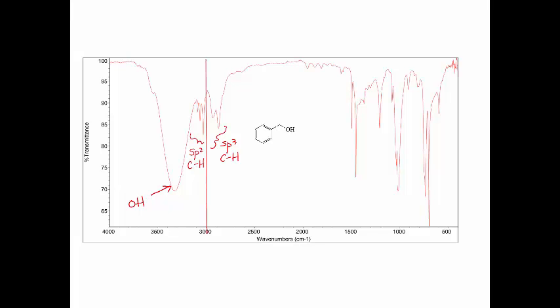The only other thing I want to point out in this molecule is this bumpiness here that is just below 2000, and that's peaks from the double bonds in the benzene ring. Sometimes those are prominent, sometimes they aren't very prominent, but it very much depends on the substitution pattern of the ring. So it tends to be more predominant when we have a mono-substituted benzene ring. When we have di and tri-substituted, this may be less noticeable, but again, peaks are going to vary depending on the structure of the compound that you have.